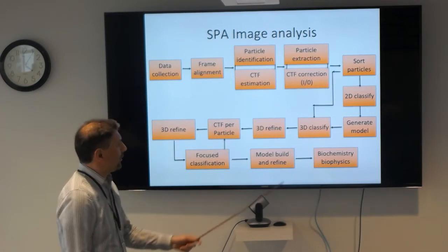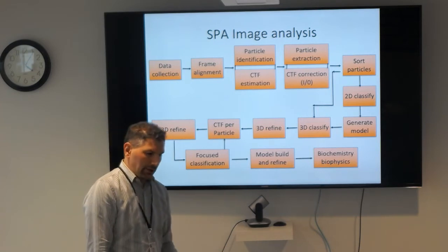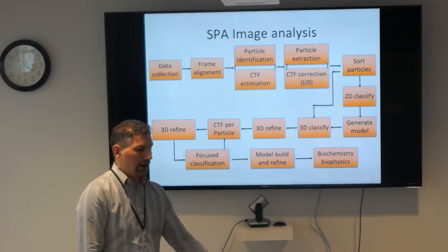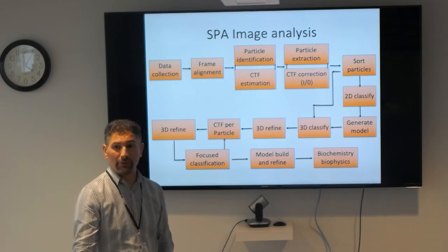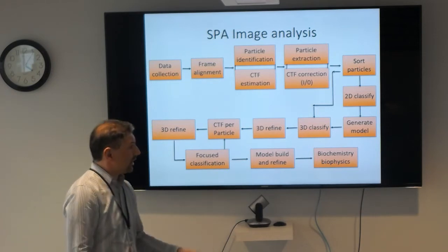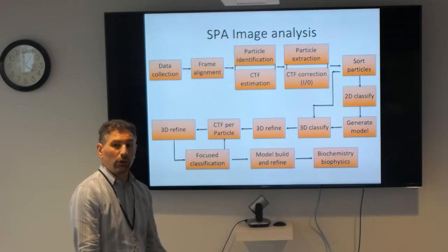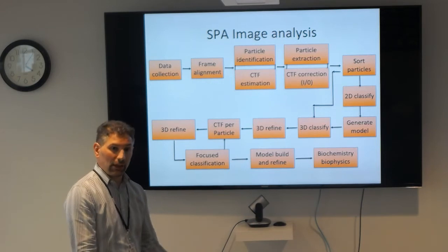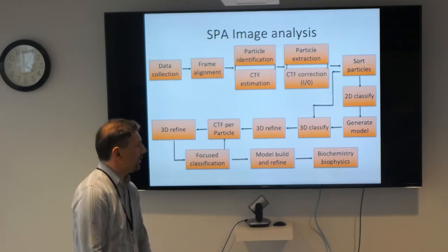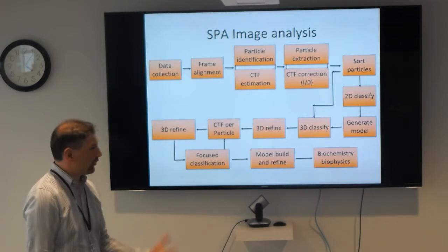Then you get good 3D class averages. Sometimes it happens that one class goes to high resolution and a bunch of them don't. We'll have one example of that that I'll talk about. Other times multiple classes go to high resolution and they all look a little bit different. If you have conformational variability, you take each class and do 3D refinement on it, and you push the resolution.